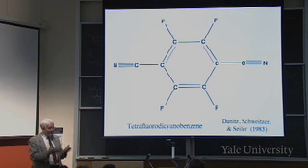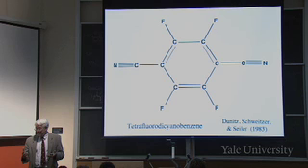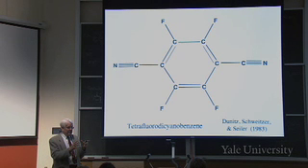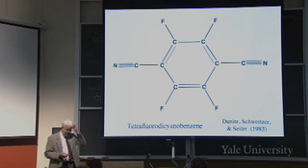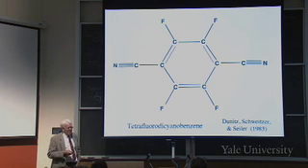If you're going to subtract something from something else and have the difference be meaningful when the numbers are almost precisely the same, right? Remember, we looked at the total electron density. They look just like spheres. So you have to be really good with this if you want to have this be meaningful, and those guys are really good. This was done 25 years ago? Okay, so they took this molecule, which is highly symmetric, which is great.